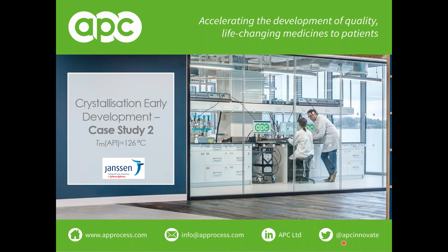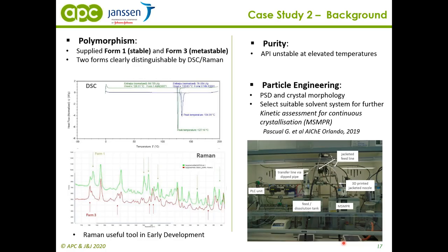So I'm switching now to the second study. The second case study was an API with a significantly lower melting point, 126 centigrade. In this case, we also got two forms, form one and form three. Form one is the most stable, and it was also clearly distinguishable by DSC and Raman.